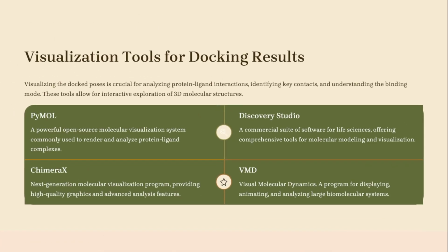And the fourth step is the visualization tools. First we have to prepare protein, then prepare ligand, then we have to give them to the docking tools or web servers, and then the number four is the visualization. The visualization helps interpret results, that how the bonding is made. And there are four major tools that can be used for visualizing.